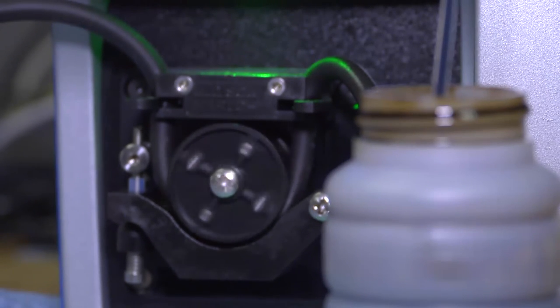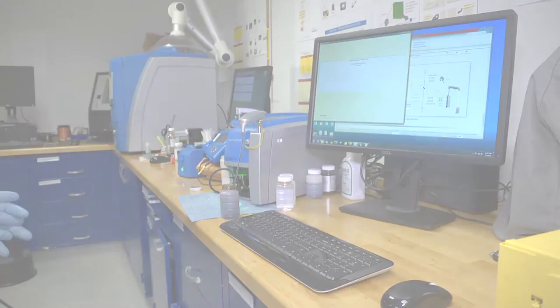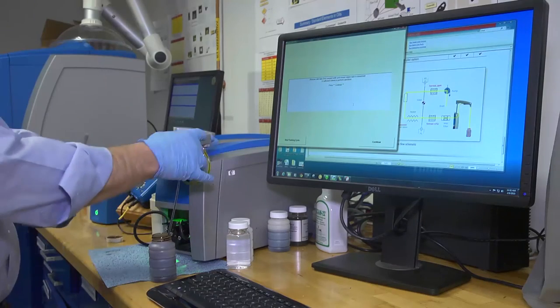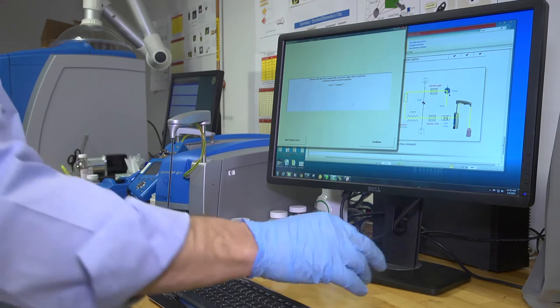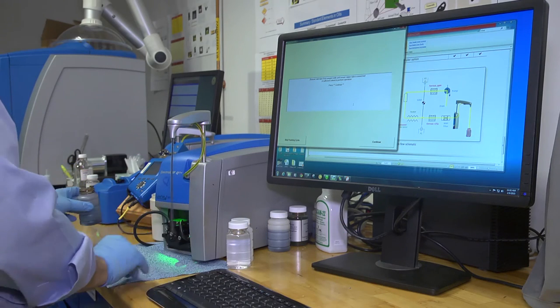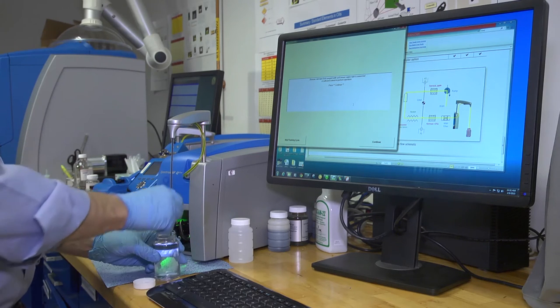A simple peristaltic pump draws the sample through the instrument and out through a drain. It's now telling me to remove the zipper arm from the bottle and then insert the solvent in order to flush.